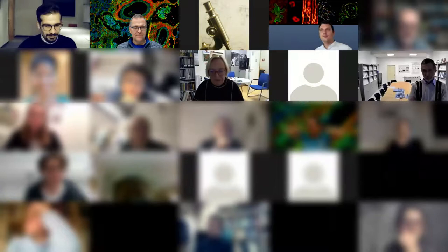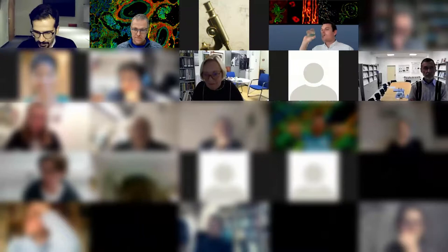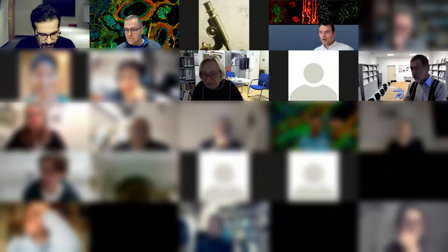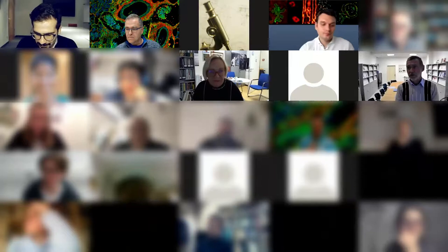Thank you. And so we go to the question from Mariano Gonzalez Pispil. How long does it take to make a FLIM plus PLIM simultaneous image? That's actually an interesting question. I had this question as well. Since we are going to modulate the repetition of the lasers, how long does that take? Maybe per pixel, and also he mentioned, for example, how long for the yeast cell example?